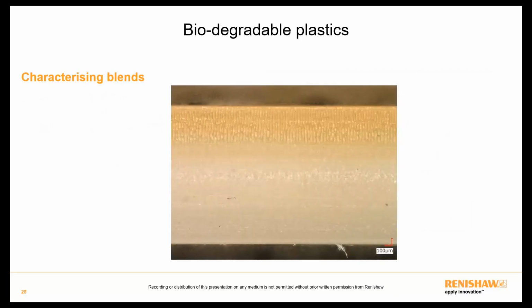This image shows a cross-section of that biodegradable plastic box that we saw on the previous slide, where we can see that one side, the top, was exposed to the environment. And we can clearly observe a color change in this material from the top to the bottom surface. And we're actually going to use Raman imaging to probe what has changed within the material. In this case, 3 Raman maps were generated, one from an area at the top, the middle, and the bottom of this cross-section of the material.